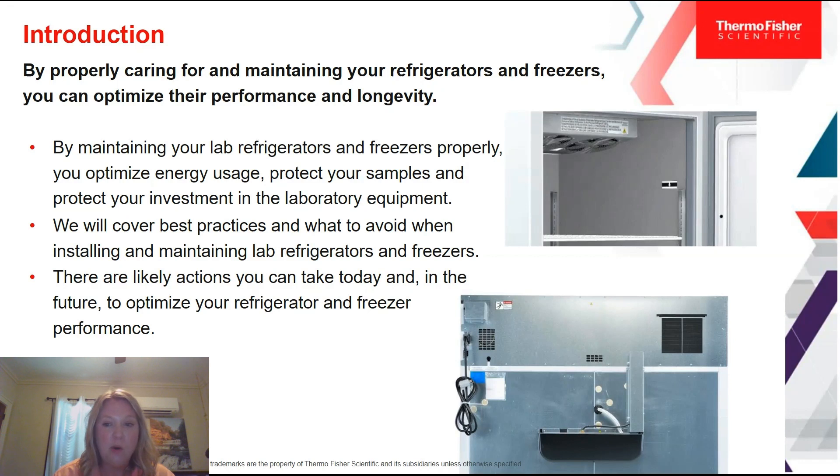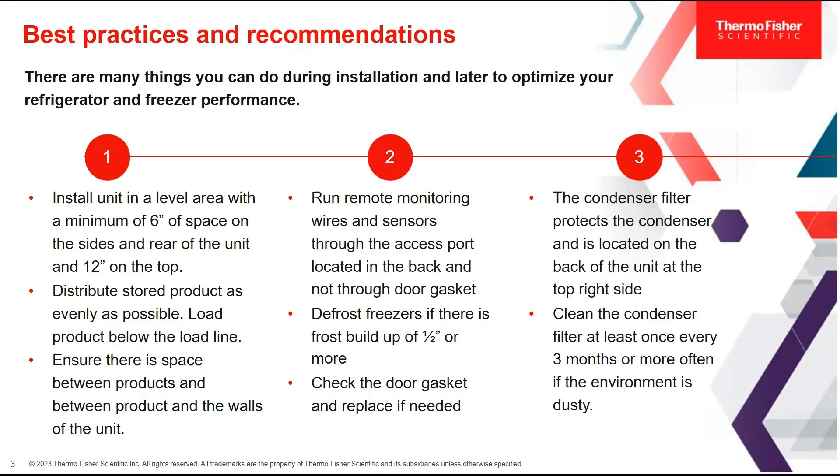We will cover the best practices and what to avoid when installing and maintaining lab refrigerators and freezers. There are likely actions you can take today and in the future to optimize your existing refrigerators and freezers — their performance — and new units that you purchase as well. We've got some best practices and recommendations and we also want to show you these right in practice using the immersive lab.